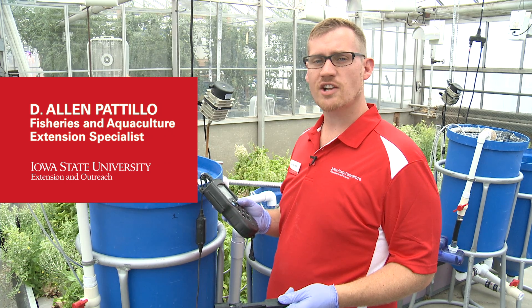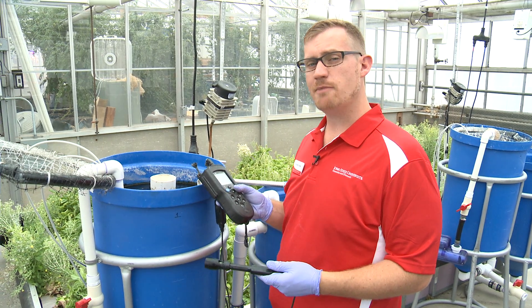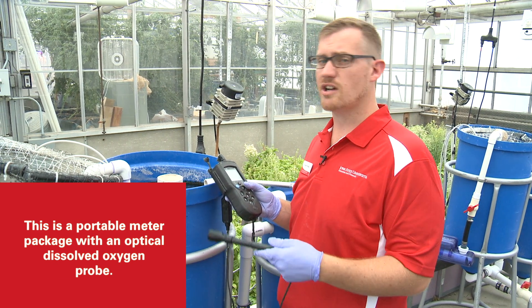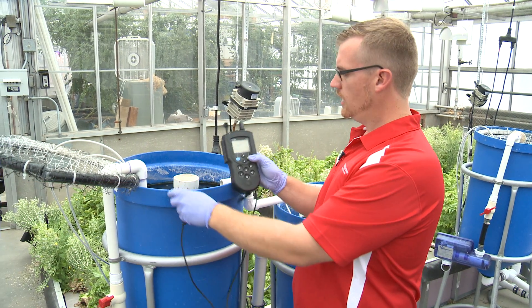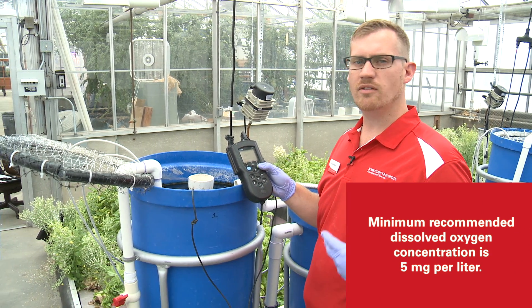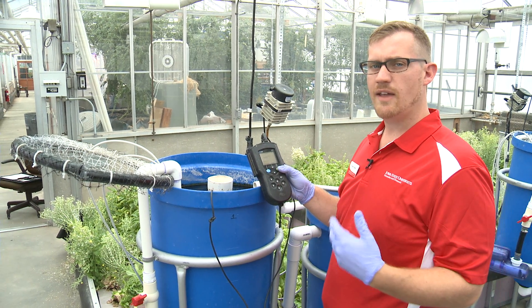Right now we're going to check dissolved oxygen in the system using this probe. We'll do this on a daily basis, just to make sure that there's enough oxygen for the fish and all the bacteria. We're going to drop this probe in the water, then hit read on our sensor. We're wanting to fall somewhere above four to five milligrams per liter of oxygen in the water.